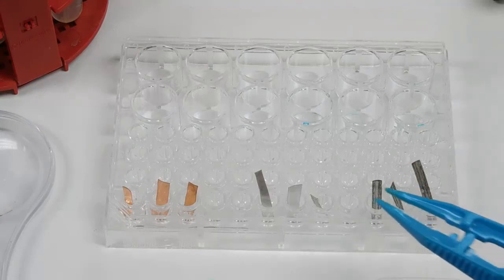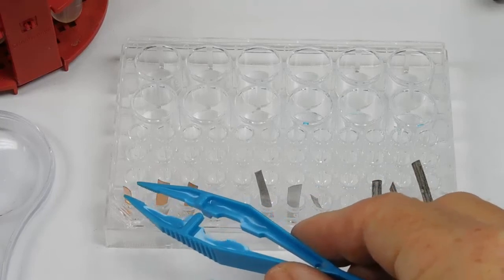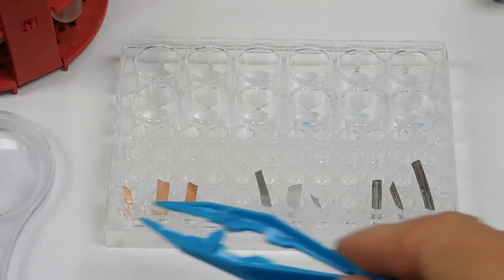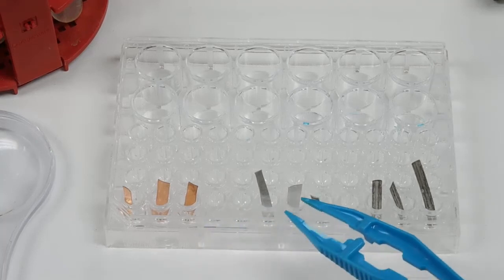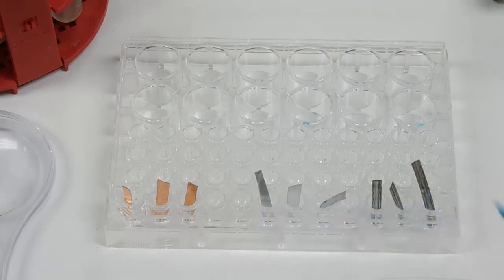Having waited approximately 5 minutes, what I will do next is take the copper piece of metal out of the solution, for each of the 3, and take a look at the surface of the copper to see if any substance has deposited onto the copper. While I was waiting those 5 minutes, I actually started the other 2 sets of reactions.